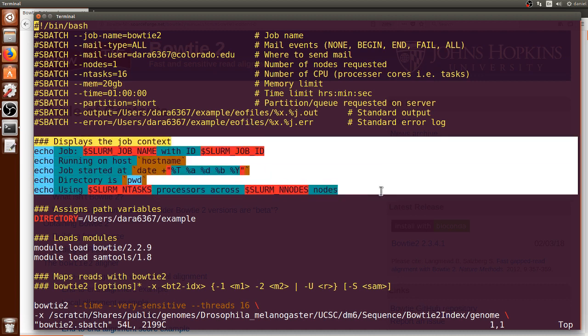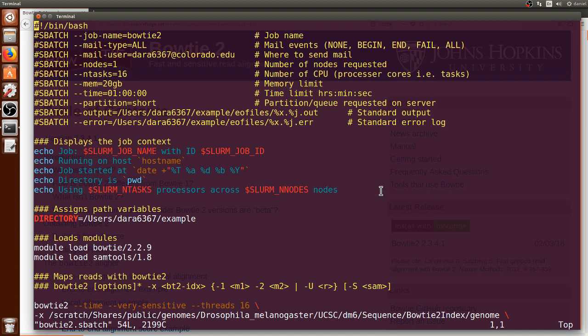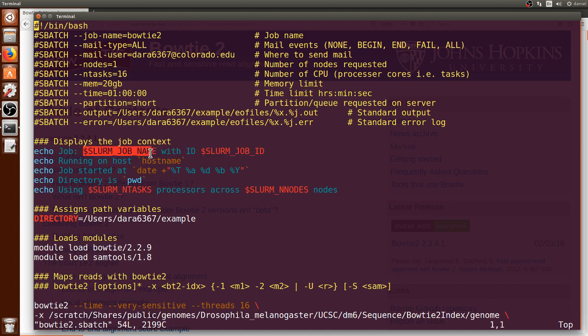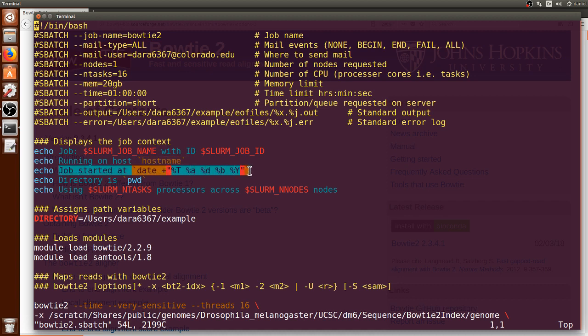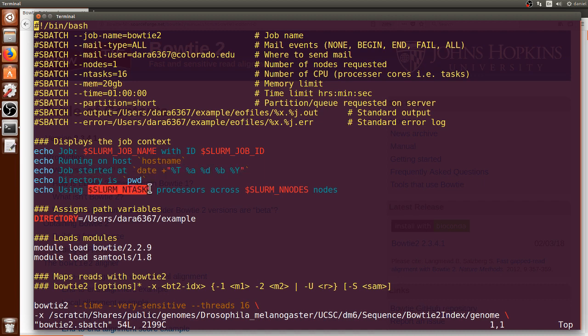And in this block of text I am specifying that the context of the job to be stored on the output file. It will be stored the job name, the job ID, the server name, along with the time and date in which the job started running and how many processors or tasks and nodes the job used. This is all just for documentation.